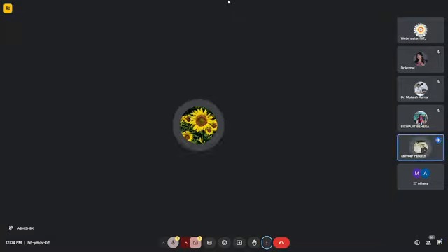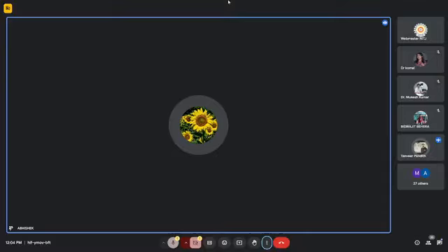My domain is not totally uranium, so I have a question. Sometimes it is shown as BDL, below detection limit. What is that actually? BDL means below the detection limit of the instrument. For our instrument, the minimum detection limit is 0.5 ppb. If your water sample has a concentration below that, the instrument will not show any result; it will show either a negative value. That means the uranium concentration in your sample is below the detection limit of the instrument. That's why we write BDL. Thank you. Okay.